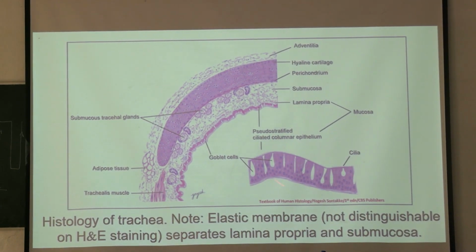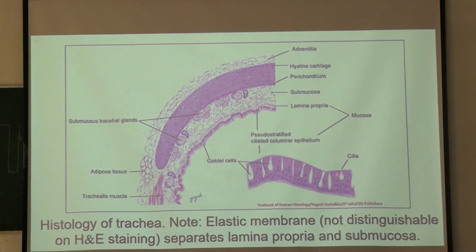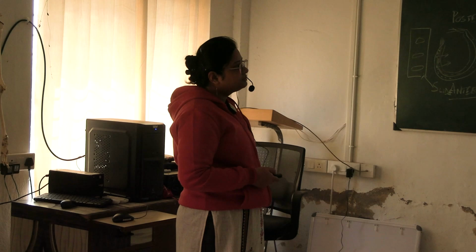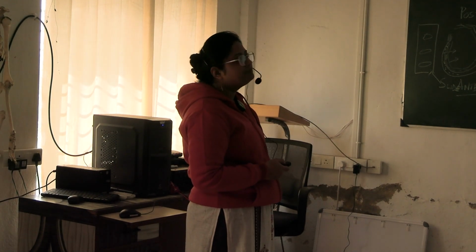You can see the cilia and the nuclei in different layers, but all the cells are reaching the basement membrane, the thick basement membrane you can see here. And these are the goblet cells or mucous cells, also present here. This is also a presenting feature of this epithelium. Like this you will see under the microscope.